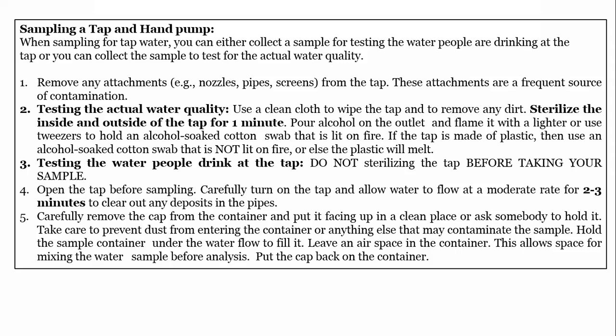So you're just going to use your cotton and alcohol and wipe it. And actually, the percentage of alcohol which you need for sterilization is 70%. Sometimes you can use other concentrations, but the most standard is 70%, which we use. We use 70% because it's more common and you can actually dilute if you want, but 70% is the best. So we use 70% alcohol for this sterilization process.